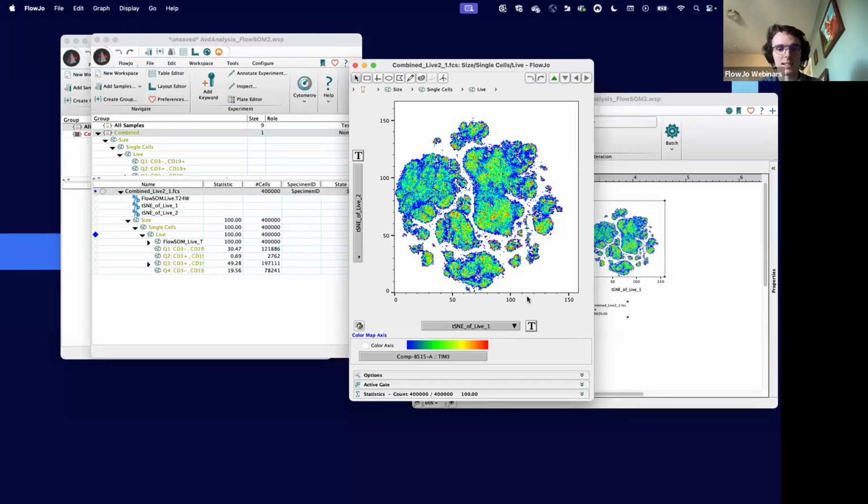If I specify 6, I know for sure it's going to group a lot of these smaller islands together, or potentially with some of my bigger islands. I don't necessarily want that. But if I go too much beyond 12, it's going to start to break some of my big islands in half, because within these big islands there's still some variation and some splits.